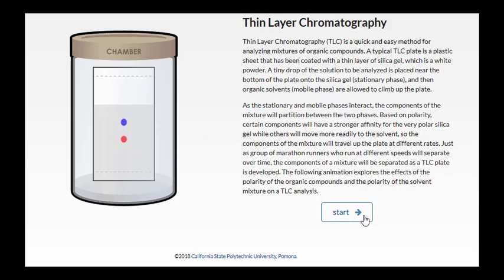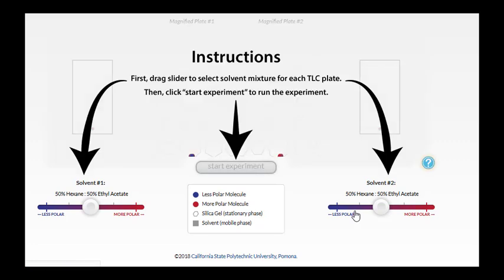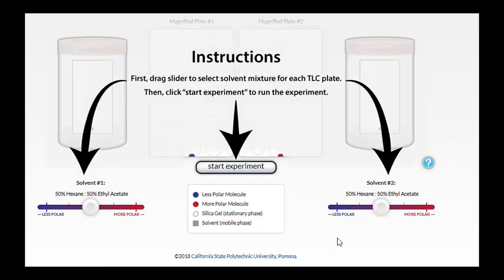So we can see what starts as one single spot ends up separating into two components as the plate develops. Let's take a closer look at this process. Here we have two chambers, two TLC chambers, and we're going to vary the solvents to see how that affects the traveling rates of the spots that we're analyzing.